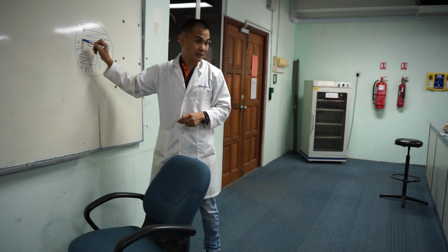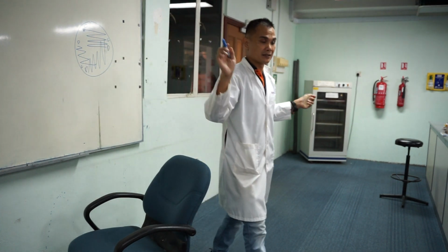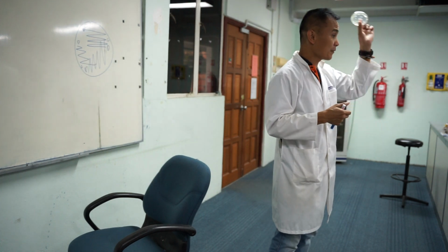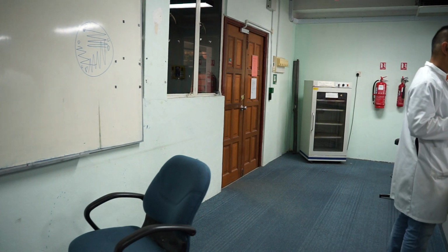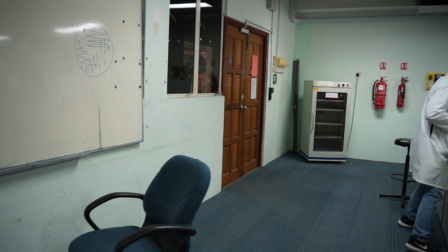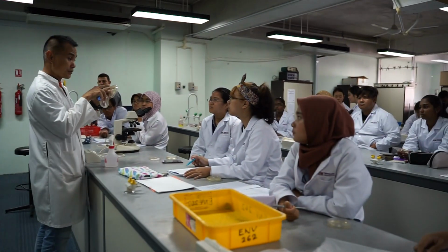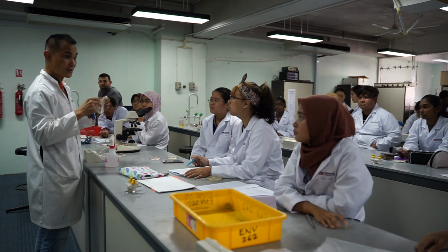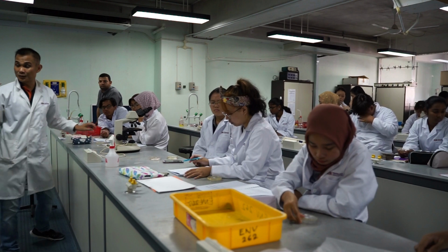Like from single colony, it will grow, and then you're going to take this and put it into the next plate. You're going to get single colony. Because now, most of you have multiple colony inside. So you want only one single colony. But actually, you are quite lucky. Like in this case, because they are not combined, you can just take them. But if they're combined, like they mix, then you cannot split them. So that's the technique we're going to learn today, which is streaking them.